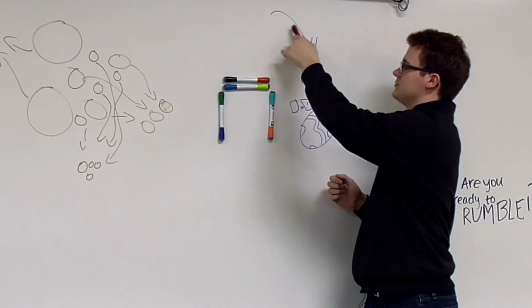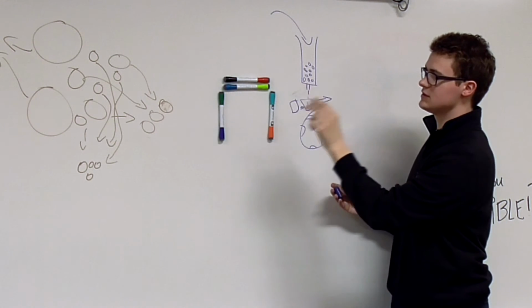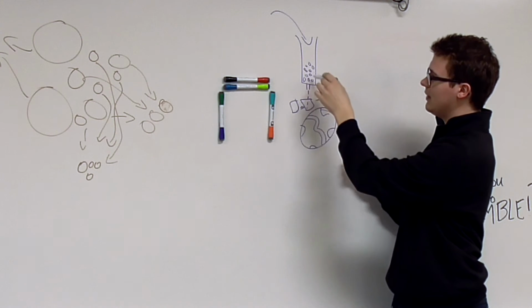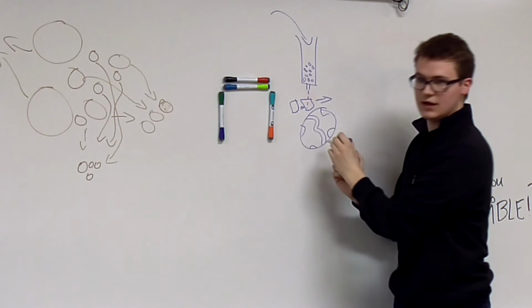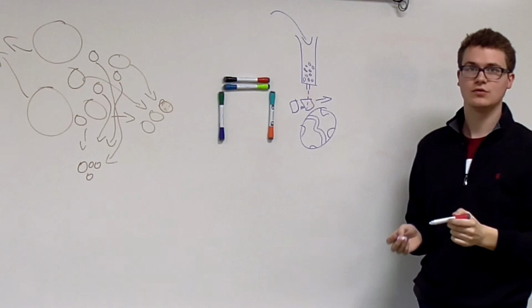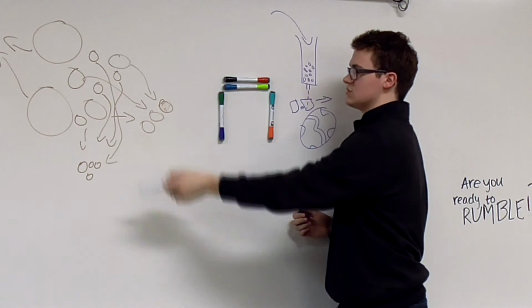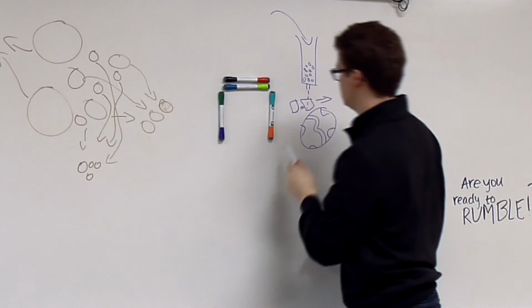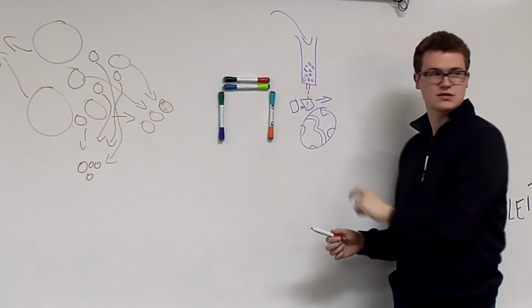The large ones are expected to cruise straight through these beads. Why? Because the small ones, or maybe the medium ones, mostly the small ones, will be getting caught up in all these little beads, in little pores or in the tunnels, and these things take time to go through. Or in other words, the distance traveled for the small ones is greater than the distance that would be traveled for the medium ones or the large ones if it's using the tunnels, and the time would be increased no matter what if they just got stuck in these little pores.